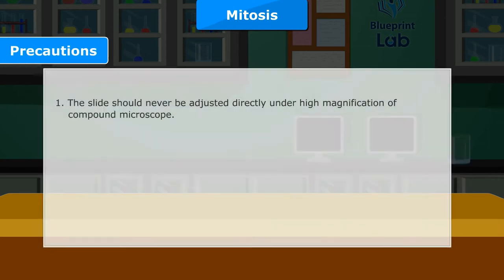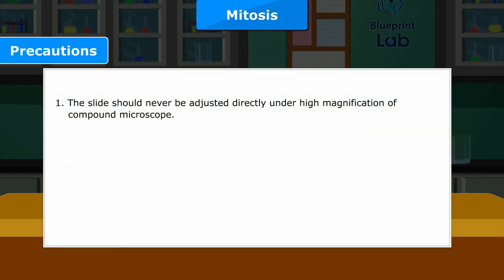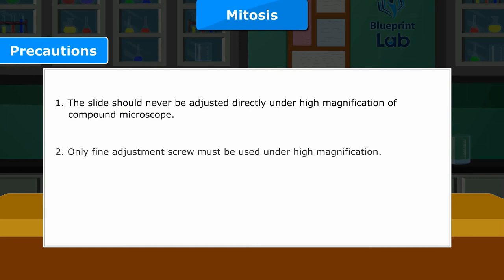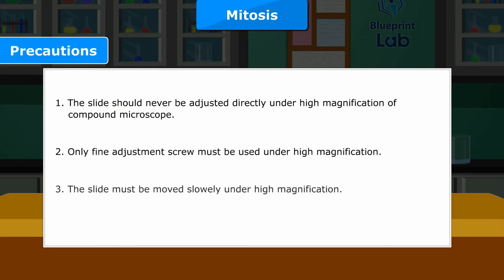Precautions: 1. The slide should never be adjusted directly under high magnification of the compound microscope. 2. Only the fine adjustment screw must be used under high magnification. 3. The slide must be moved slowly under high magnification.